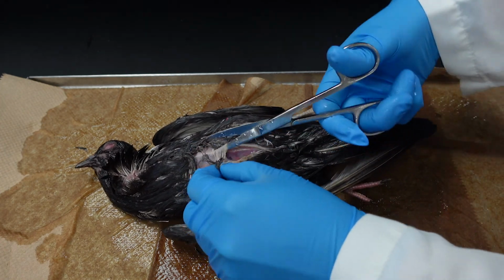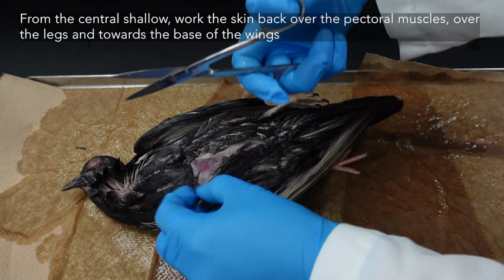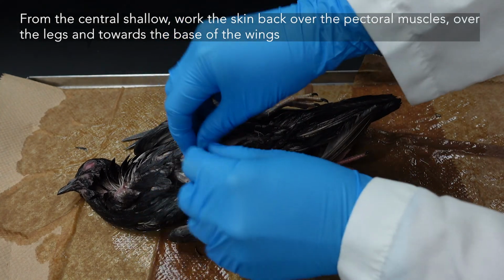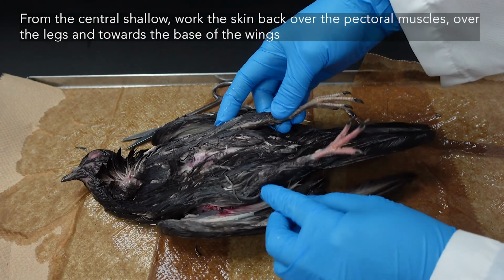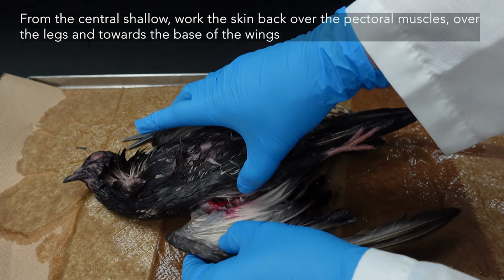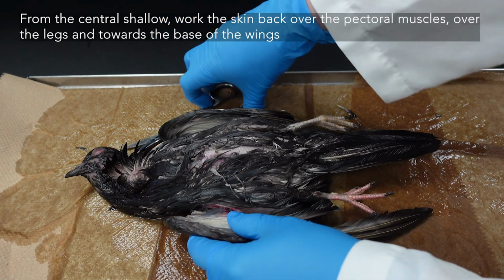And bird skin is very thin, so you do not have to actually cut at all. You're pretty much just lightly going through the skin here. And then you can work the skin back along the sides of the body. You have to go around the little legs. The knees are tucked really tight up here. So you work that skin around the legs, and then off the back towards the arms, the wings. But again, be careful of that throat area.